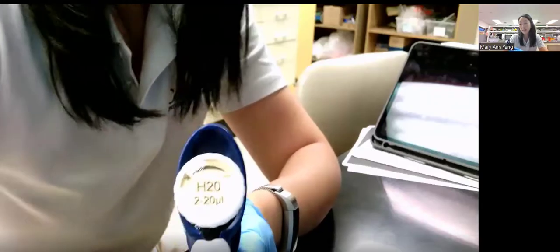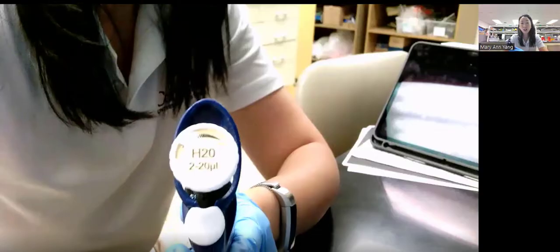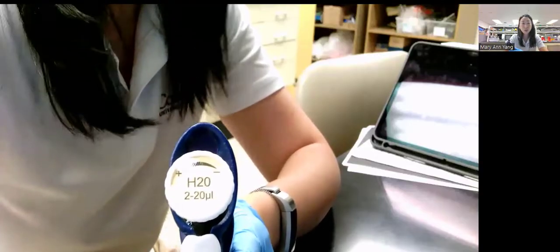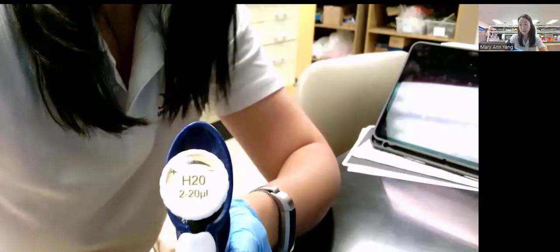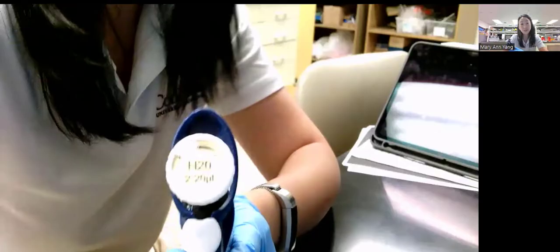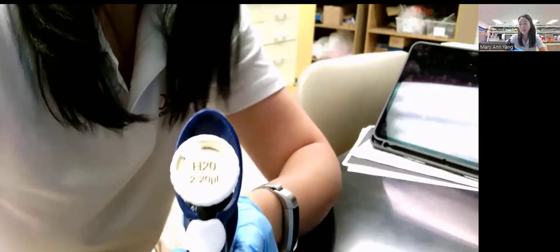Now with the pipette in your hand, let's take a look at the top label. This top label is going to show you the name of the pipette. Now you might not have the exact same one as I have in my hand, but it's okay.